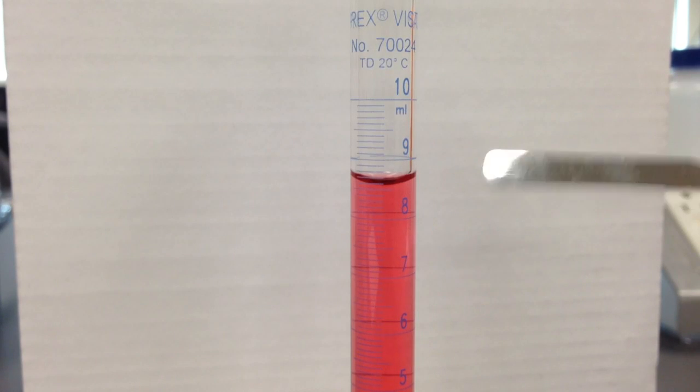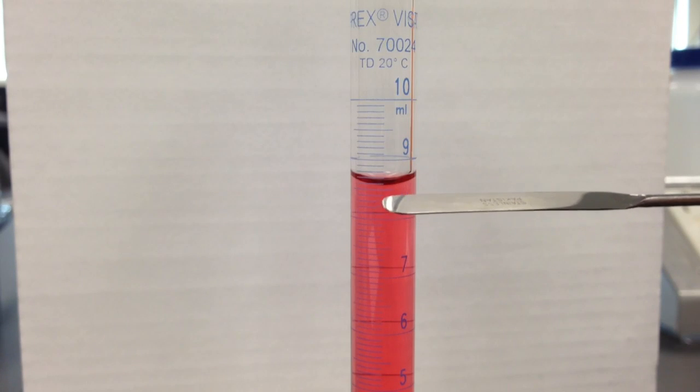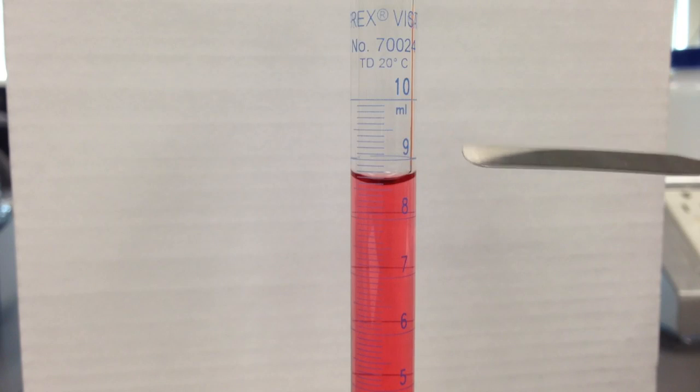We have a numbered mark of 8 here and we have a numbered mark of 9. We have unnumbered marks between 8 and 9 valued at 0.1. In order to go from 8 to 9, we would go 8.1, 8.2, etc., up to 9.